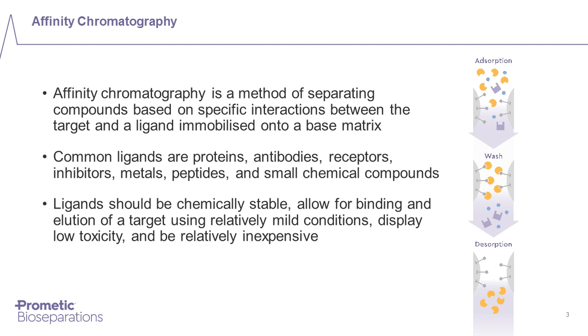Those interactions typically in affinity chromatography are multimodal in nature, so there's not a specific force that drives that, but most likely a combination of forces.